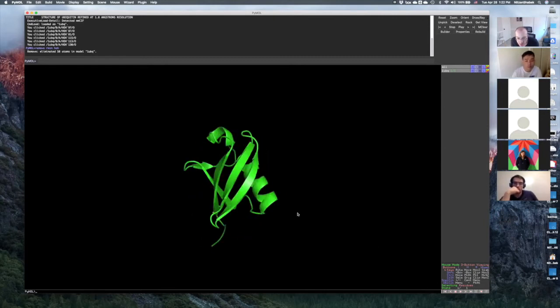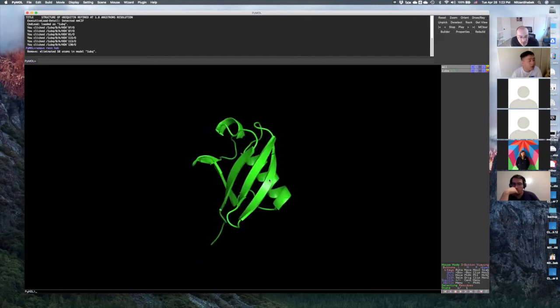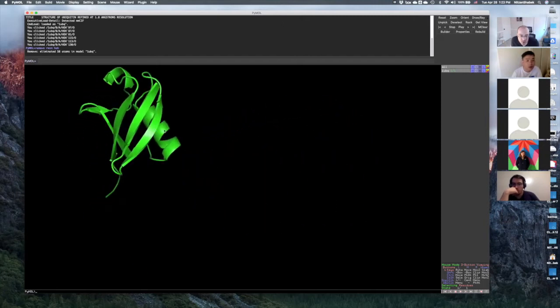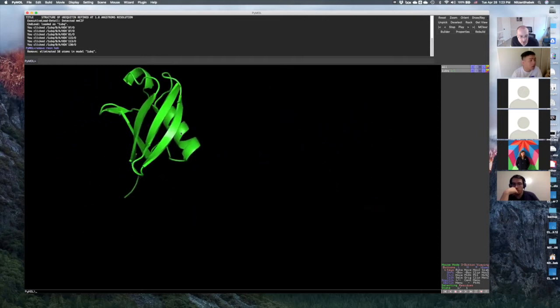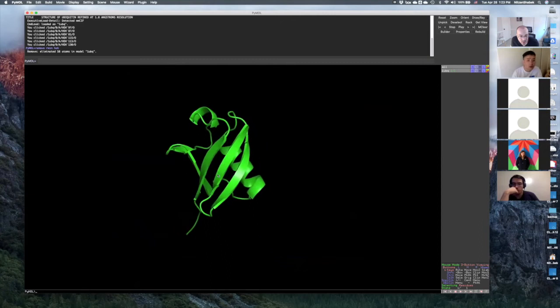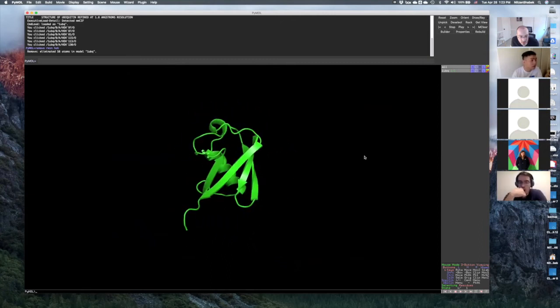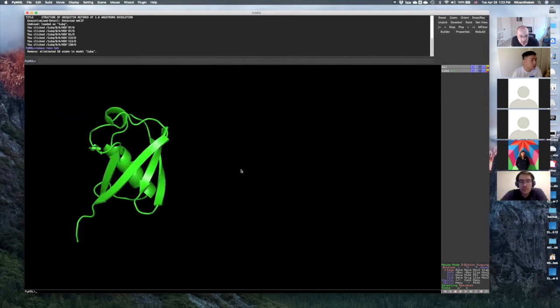If I press the right, I zoom, okay? That's what it's saying here. Now, what happens if I press the middle, okay? With the middle, I can move the structure from one side to another if I just keep it pressed, okay? Try to do that. Try to play and be very comfortable with your left click, your right click, and this one, okay?